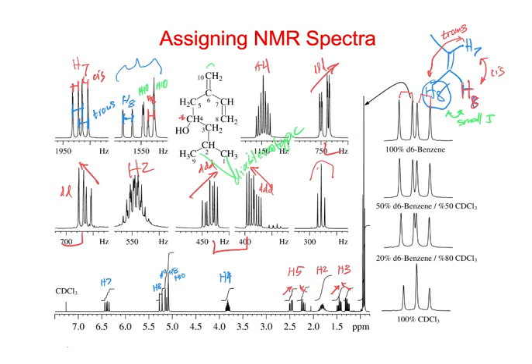Right. So what we would have to do to tell whether the doublets are as I drew it here, or from here to here, and from here to here, is this: the chemical shift should be changing, but the coupling constant should remain the same. Yeah, okay. It looks to me like what I've marked as those looks the same as this. These look like the coupling constants to me, but I didn't measure them out or anything. I could do that here.